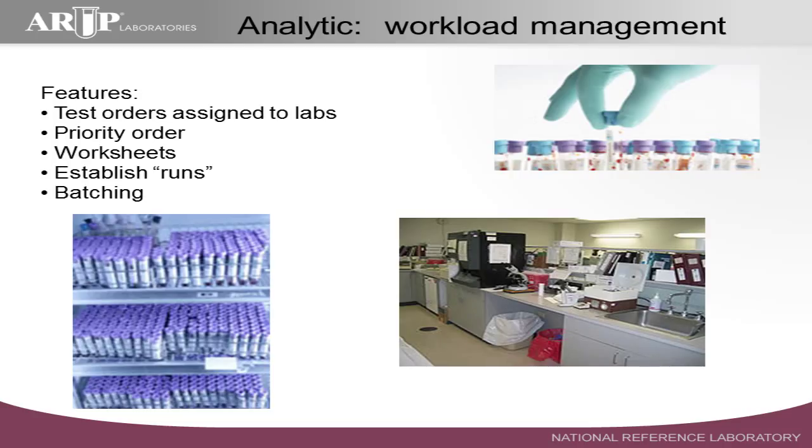So that's all clarified in the LIS, and so we know how to assign those orders when they come in. And that can even vary by time of day. During the day shift, you may have enough staff in one lab, so you route all the tests to that lab, but in the middle of the night, you may have a reduced staff and you change that routing so that now that test is assigned to a different laboratory section.